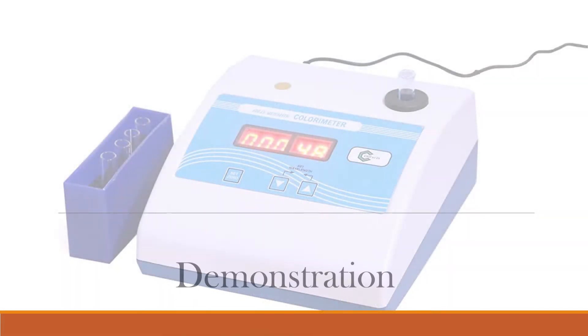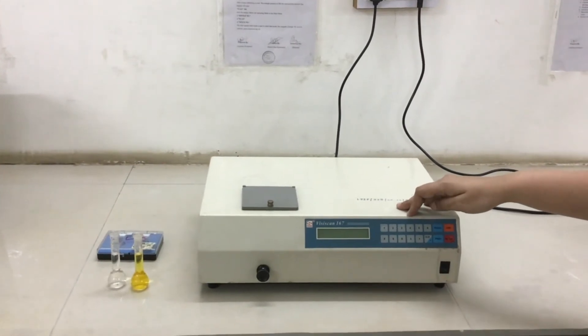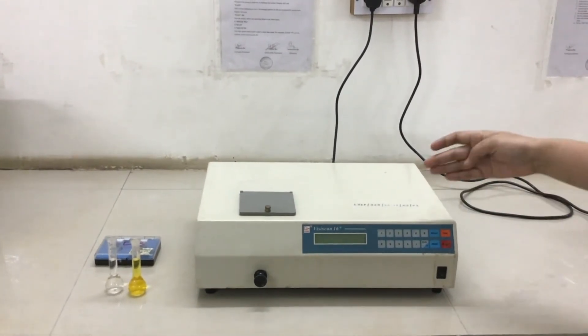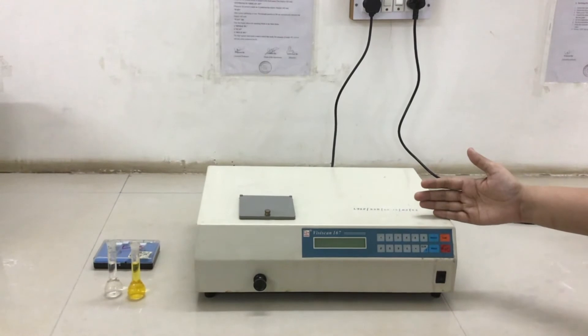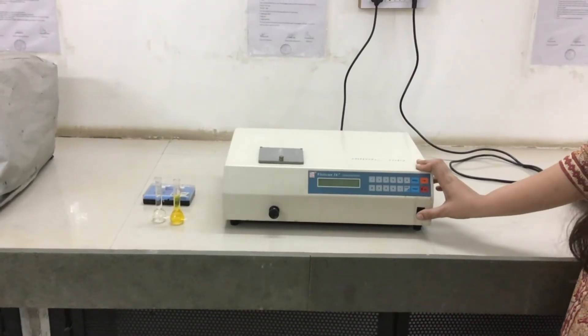Now we will see a demonstration of the photometer. We are starting the second session — operation of the colorimeter. This is a double beam spectrophotometer made by Viziskin, operated in the range of 400 to 800 nanometers, which is the visible range. We will now initialize the instrument by switching it on.